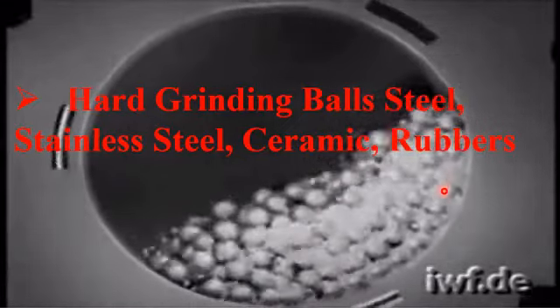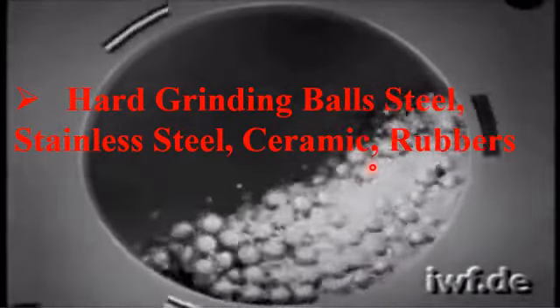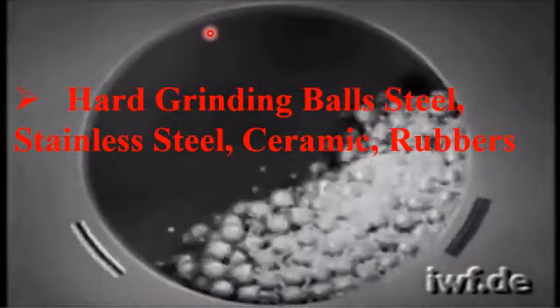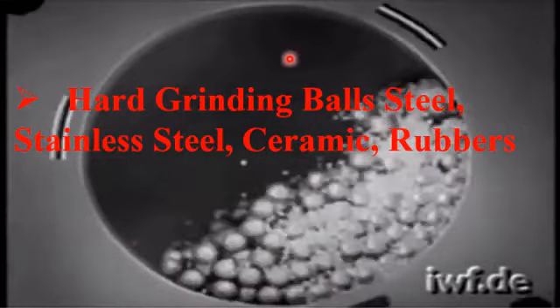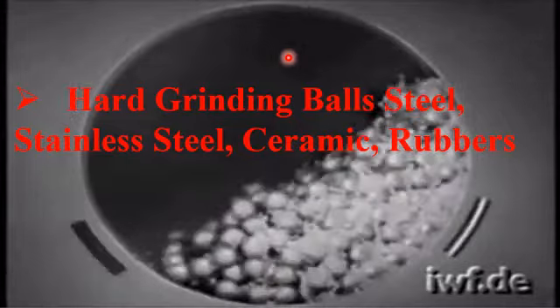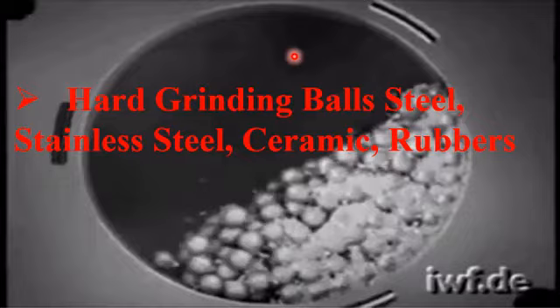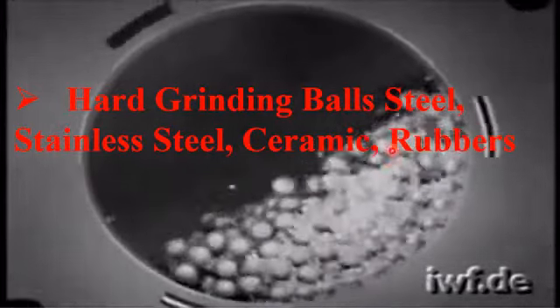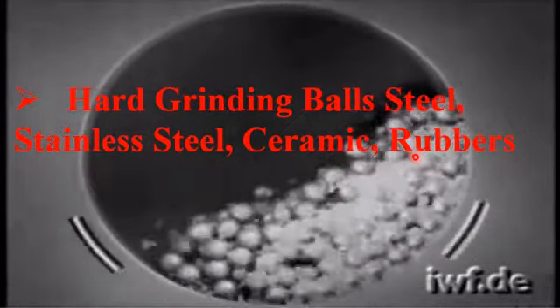Okay, please note, students, that the grinding balls inside the ball milling chamber or drum will depend on the nature of the material which we want to convert into a nanoparticle or nanopowder. So in case you want to convert a soft material, usually rubber balls are used for the crushing of those materials.